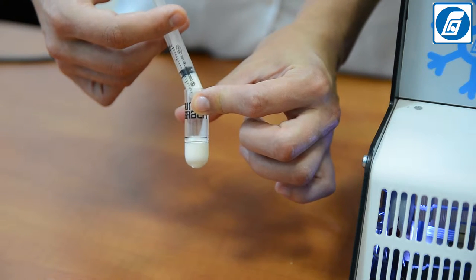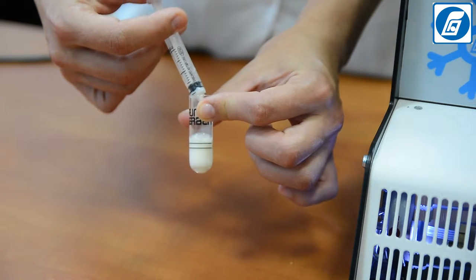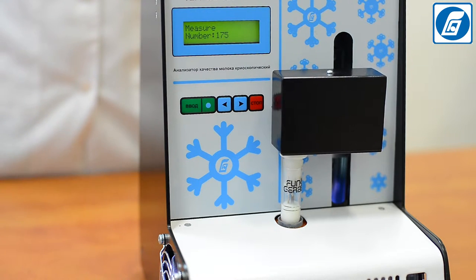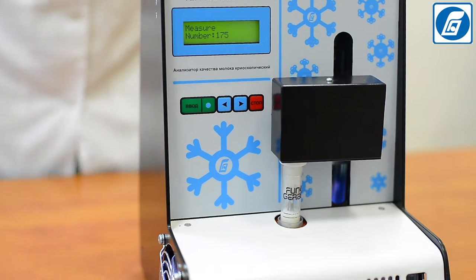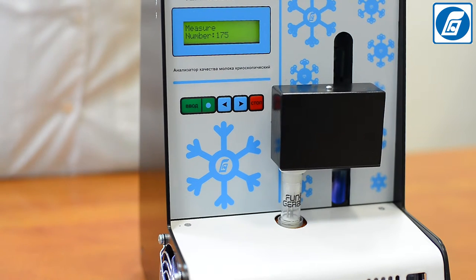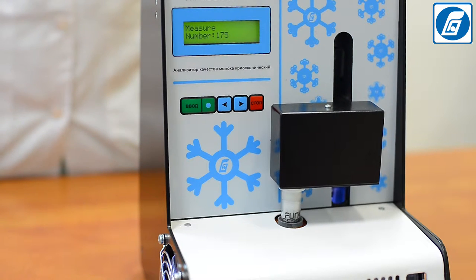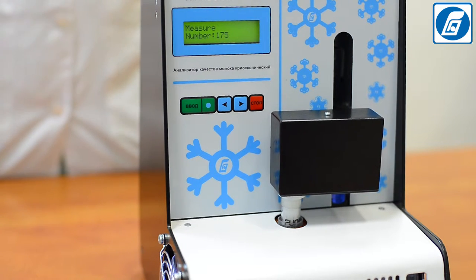Thermoscan Mini is intended for quick determination of the freezing point of milk by the thermistor-cryoscopic method, which is a reference arbitration method of freezing point determination. This method is more accurate and takes priority as compared to other indirect methods of analysis.